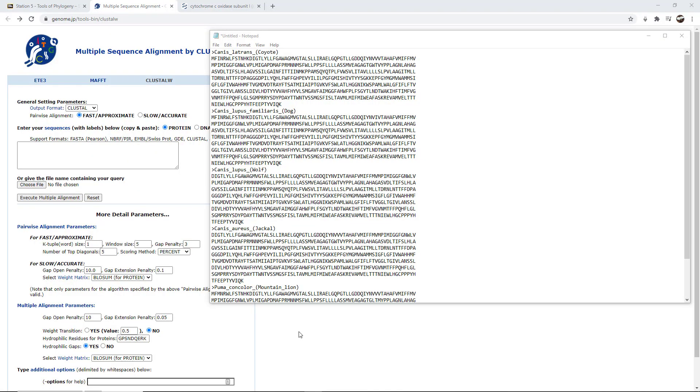Hello, this is Curtis Heckerman, and in today's video I'm going to show you how to use the multiple sequence alignment in ClustalW Online using sequences that we downloaded from GenBank.